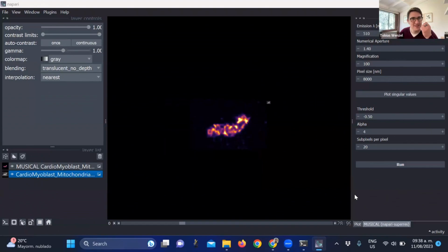Okay, I have another question, and maybe we'll get to it anyways, but you mentioned this oversaturation earlier. I guess that is an issue with any technique. If you oversaturate your signal, you don't see the fluctuations, or is there a way around this? Yes, of course. You have to be able to observe the fluctuation as well as possible. If you saturate your image, or you have so-called hot pixels, it will be an issue. In principle, the methods can handle it, but the better your data set, the better the results. But it's not ideal to have this saturation.